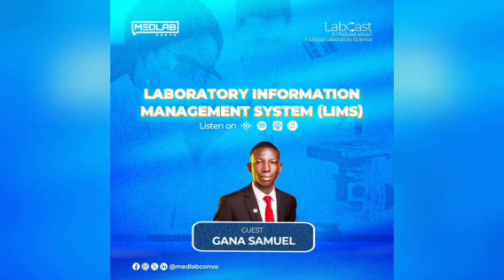Thank you. The next question that I want to ask, you have already shed a little bit of light on, but I will still ask. A lot of people are so used to manual record keeping that they don't know that LIMS is integrated with analyzers and equipment, and because of that, it helps to reduce manual errors. So I want you to throw a little bit more light on that in a very practical sense.